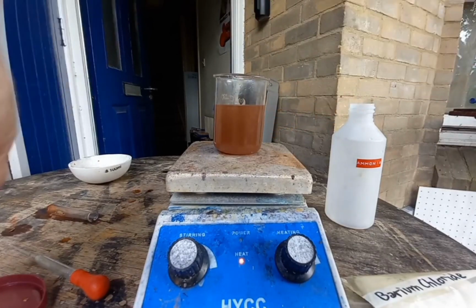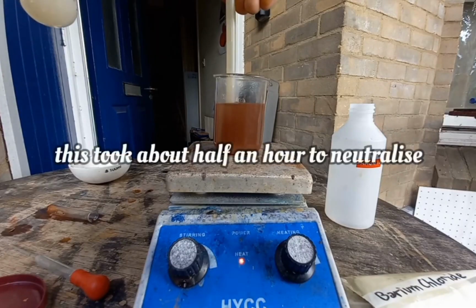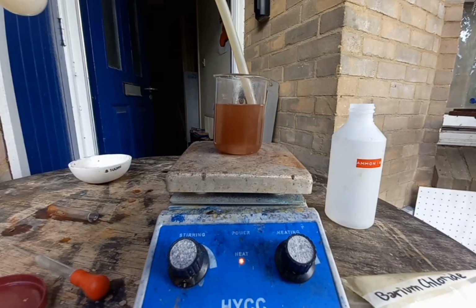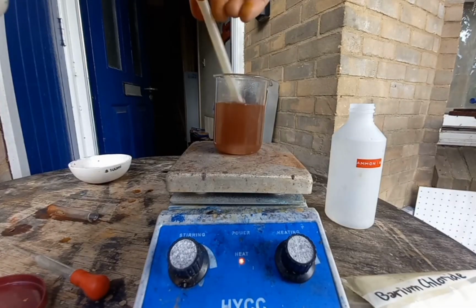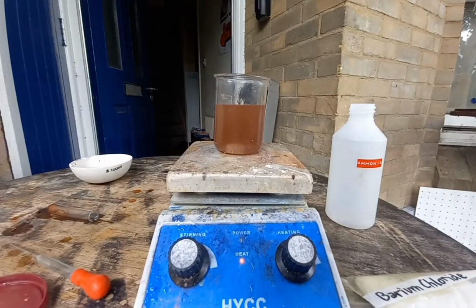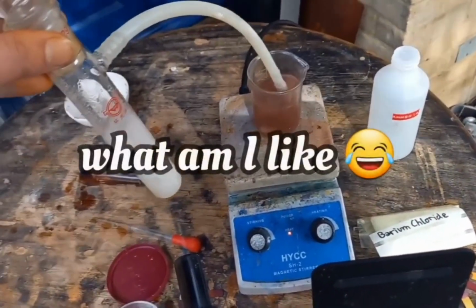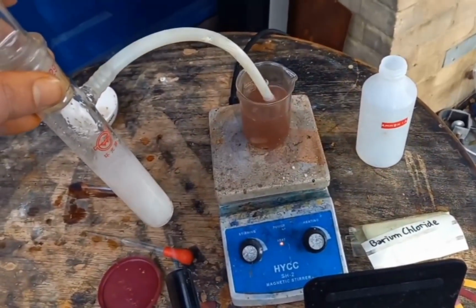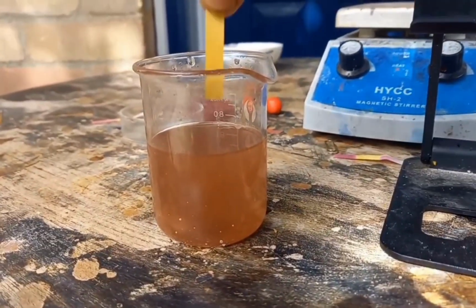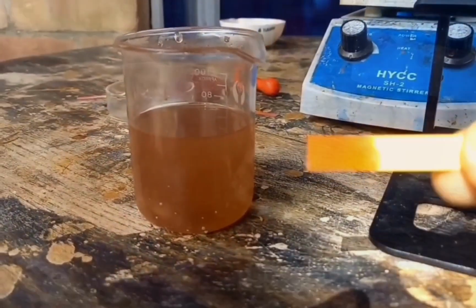Still very acidic. Still acidic. Getting there.